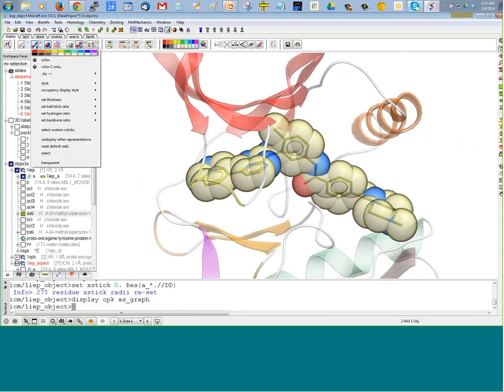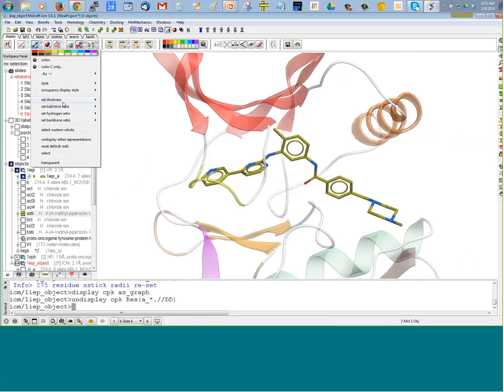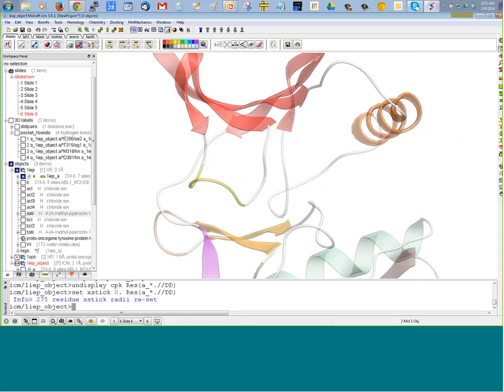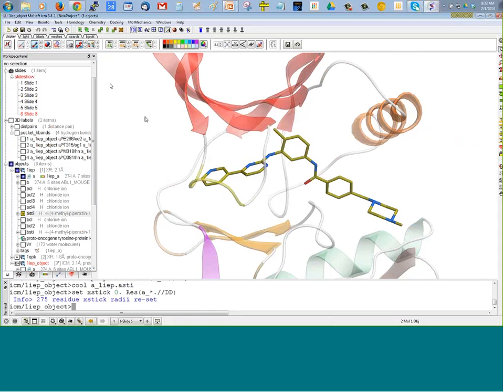And with the stick, we can change the coloring as before by object, occupancy, variety of things. You can change the style to chemistry, for example, or there's different styles for the stick, or just plain, as shown here.